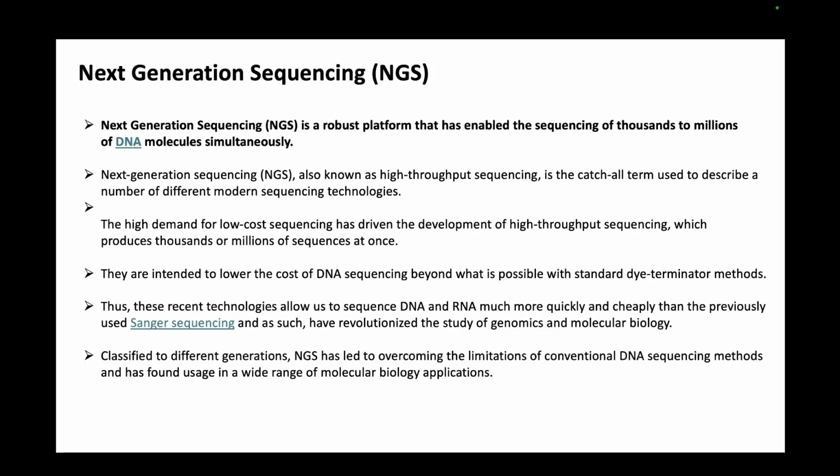So you can do a lot with genomic data right now, and that is all due to NGS because in such a short amount of time, so much data you can generate, and different types of data also you can generate, which you can study and analyze and have molecular biology applications depending on your findings.